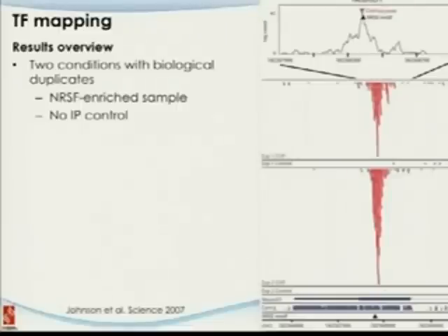So you can see these are the genomic locations. At this location, there is a protein binding site. And once you zoom in on this area, what you look for here is that there are so many different short reads aligning along this region. This is the ChIPseq region, and they also have some type of control. By control, I mean that they don't use an antibody to target anything. So it serves as a negative site, and you can see you really don't see anything around the control. And this is another biological replicate, and this is its control. So you can see a very clear picture that there are pretty strong signals in the ChIP assay.